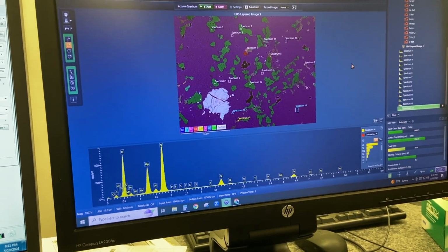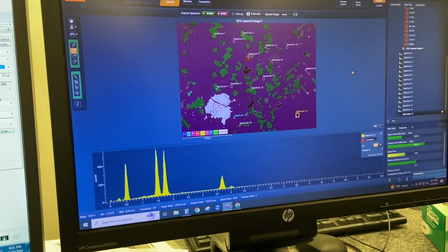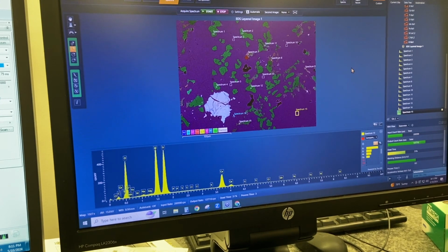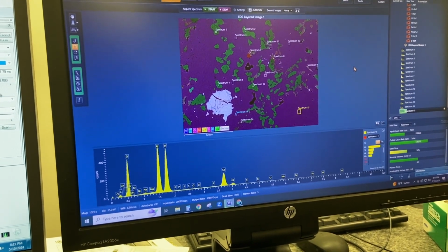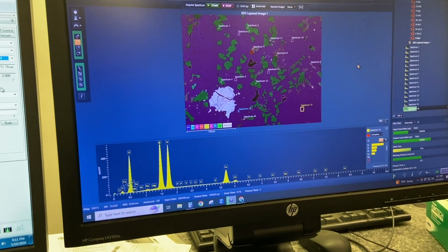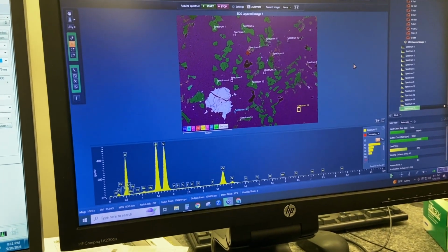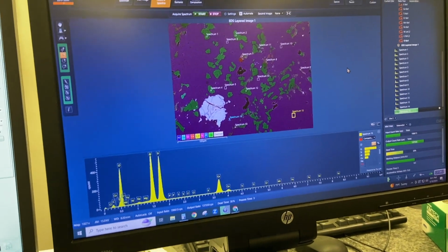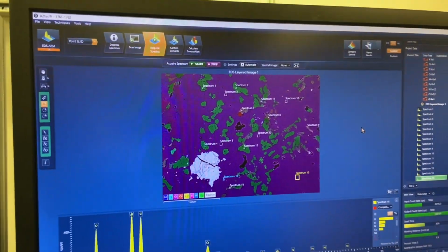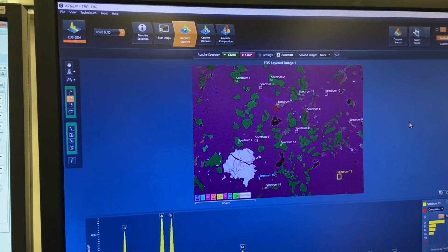Which means that if you had a troctolite in composition and you melted it and then cooled, you'd form probably either olivine or feldspar first, let's say. It does depend on your bulk composition, but you get one and then you hit the cotectic, form the other one, and then hit the peritectic. I guess maybe that's why you're getting pyroxene. So you have some chromites here, so maybe these are remnants.